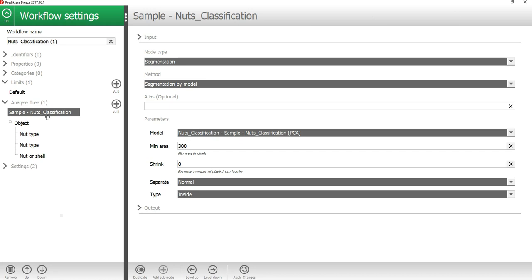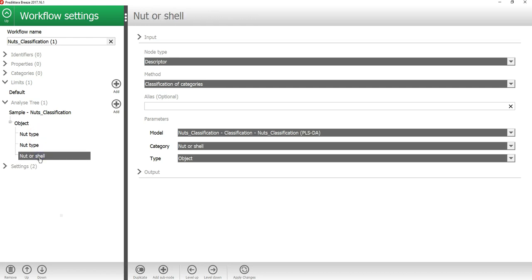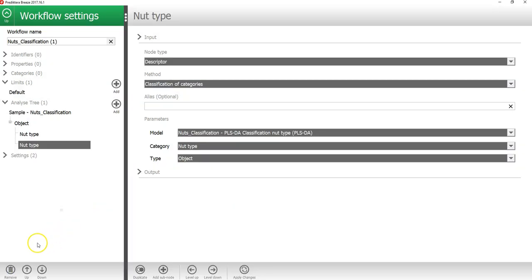To modify my workflow, I will press the edit button. In the menu on the right under the analysis tree, you can see the steps in the workflow. First, you have the sample model and then a number of descriptors, which is the nut type models and the nut or shell model. By clicking on them, you can configure them in the menu on the right side. I will click on the nut or shell model and then press remove to exclude this from the workflow.